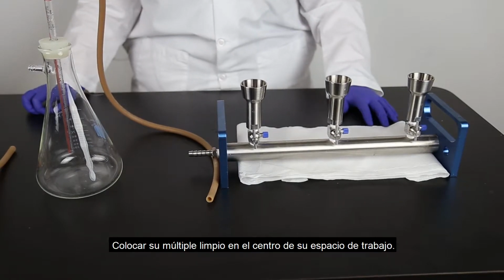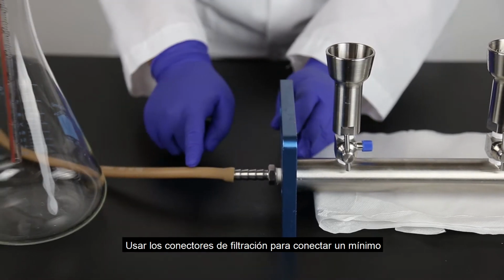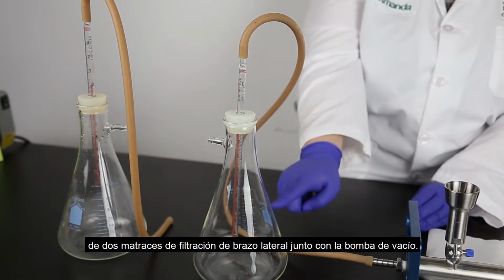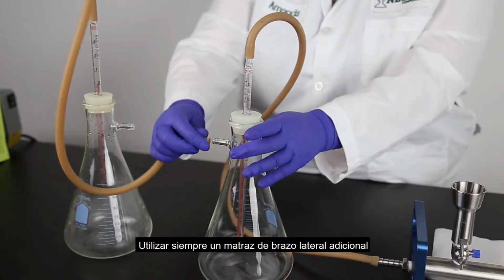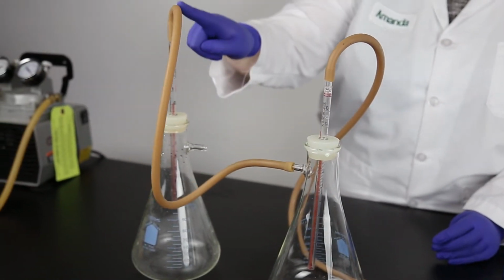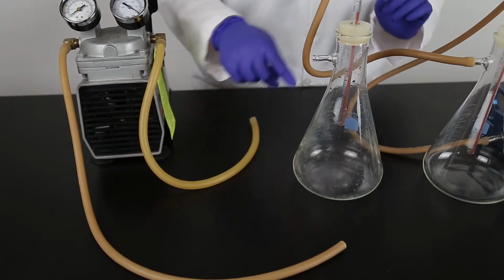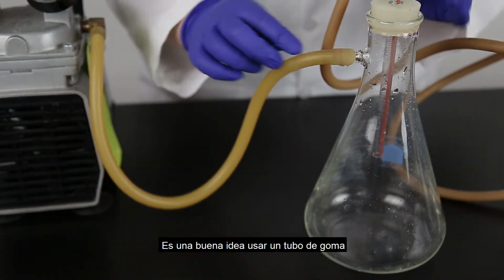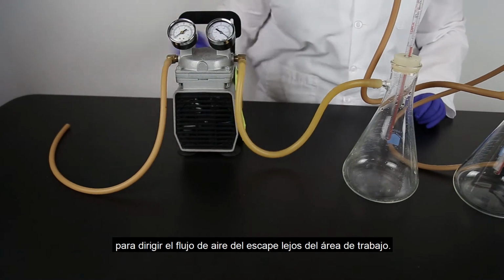Set your clean manifold in the center of your workspace. Use the filtration connectors to attach a minimum of 2 sidearm filtration flasks in tandem with the vacuum pump. Always use an additional sidearm flask to prevent water from getting into the vacuum pump. It's a good idea to use a piece of rubber tubing to direct the exhaust's airflow away from your work area.